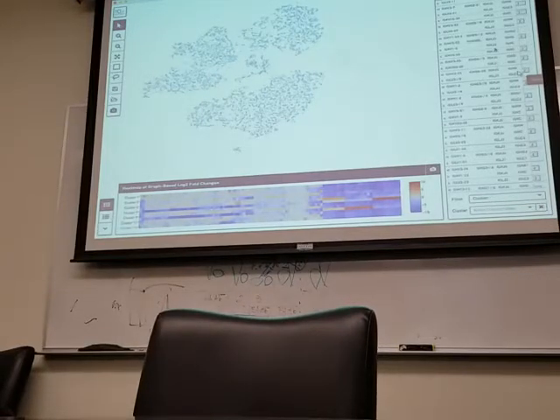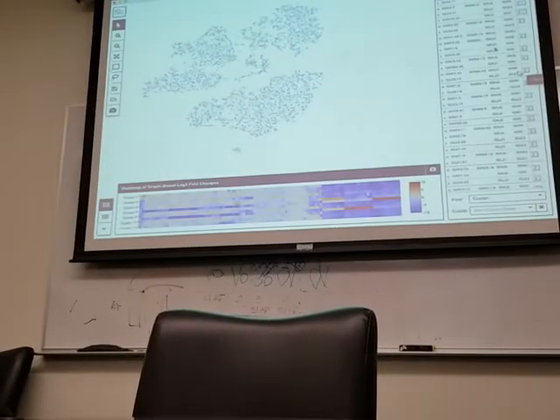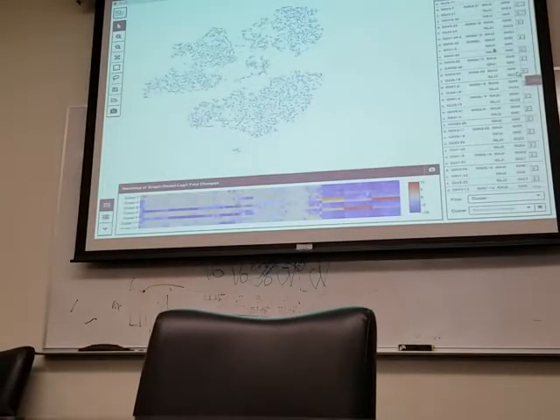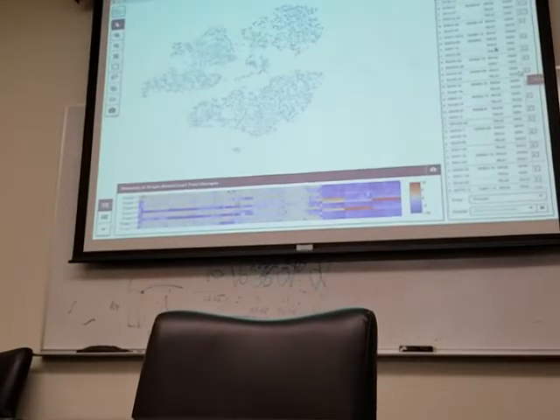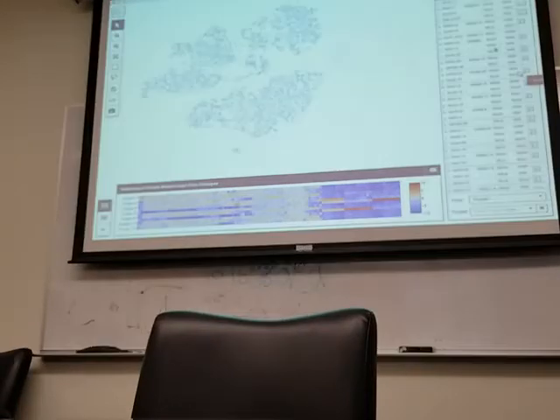Well, and getting back to the naive versus plasmablast question, we do have sort of plasmablast. So I think that's all in the box. We have to. But can I just make this one point? Whatever anybody did before is fine, but what I want to do is do something a little different, maybe. Go step by step, because I'm in discovery mode. I don't assume anybody knows anything, because I figure most people haven't worked this out very well.